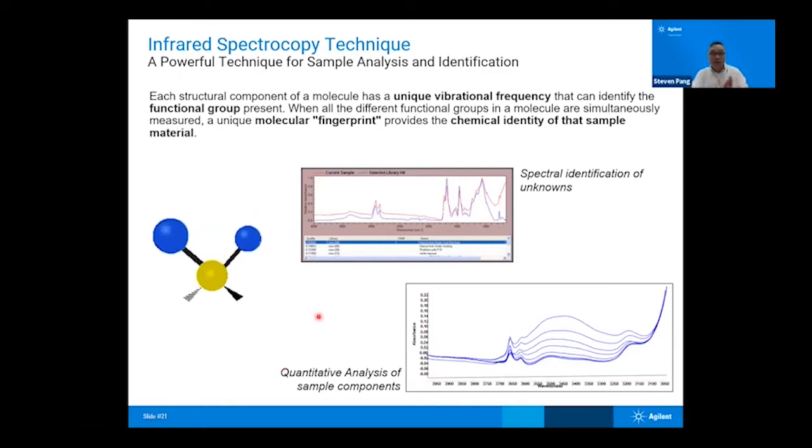And because of that, the infrared technique is a very powerful technique that has found a lot of usage for over 50 years. Okay, and one of the attractions is that infrared is non-destructive. It doesn't destroy your sample. You can still retain your sample after the analysis.